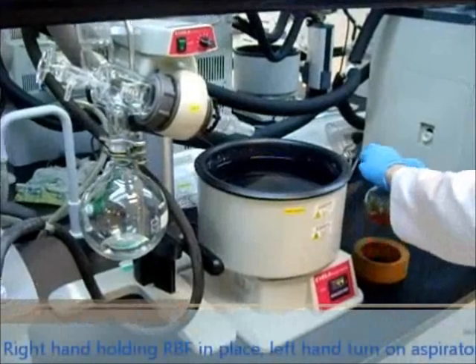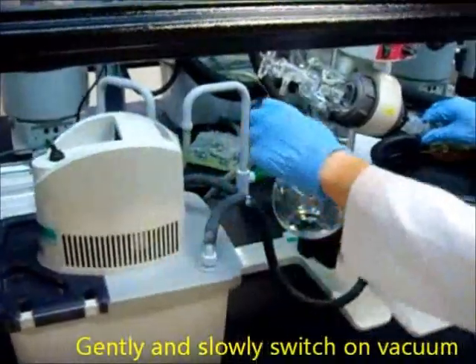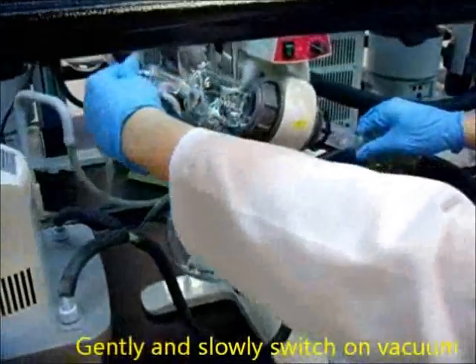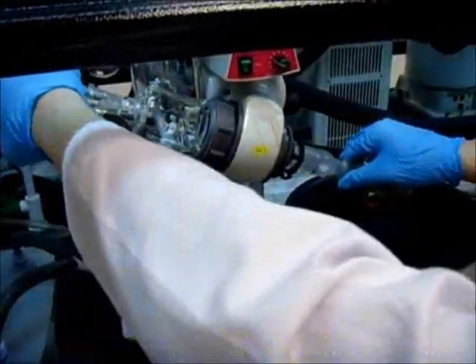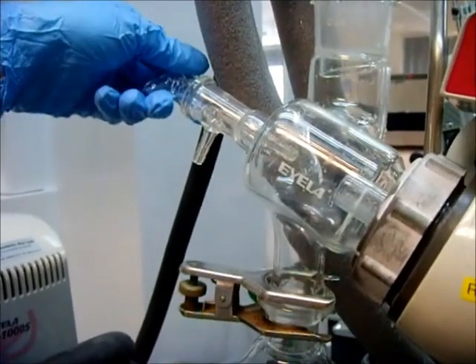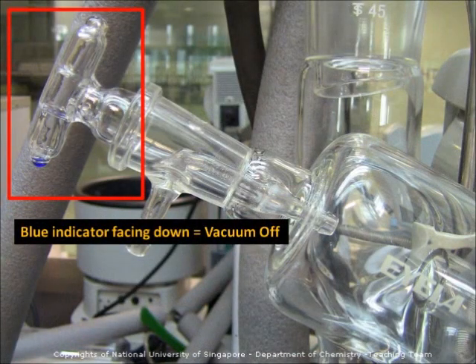Now, with your right hand holding the round bottom flask in place, turn on the aspirator using your left hand. Gently and slowly switch on the vacuum and listen for the change in the sound of the evaporator. If the blue indicator is facing down, the vacuum is off; if it is facing you, the vacuum is on.